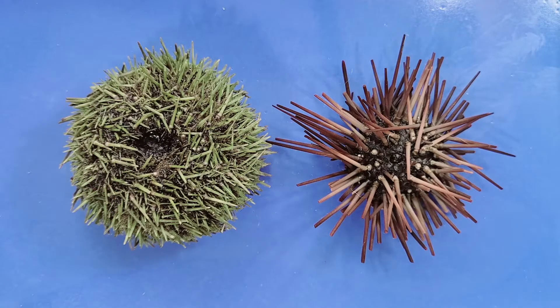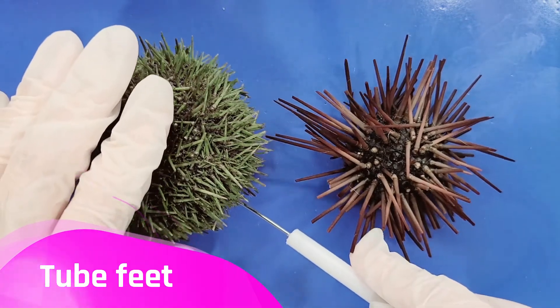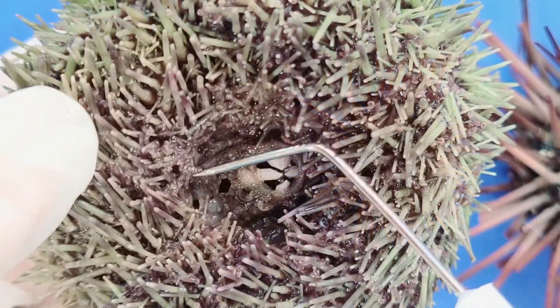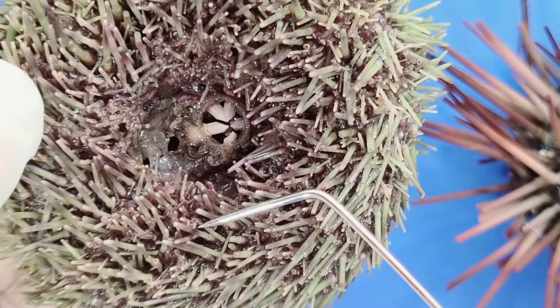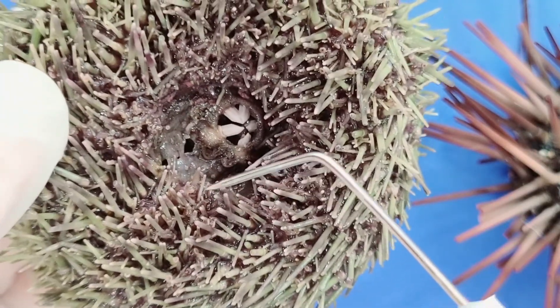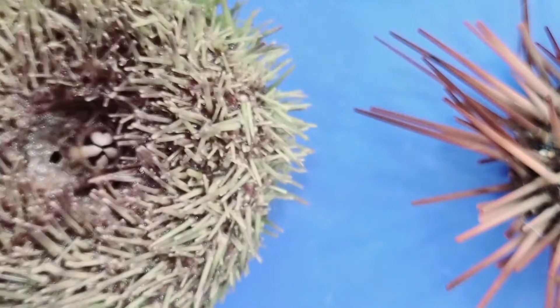Sea urchins move by walking on many flexible tube feet. These tube feet are located on the oral side, near the mouth. Here are the tube feet — you can see a lot more buried along the spines. Basically anything that has a circular tip is a tube foot, and the circular tip acts like a sucker.